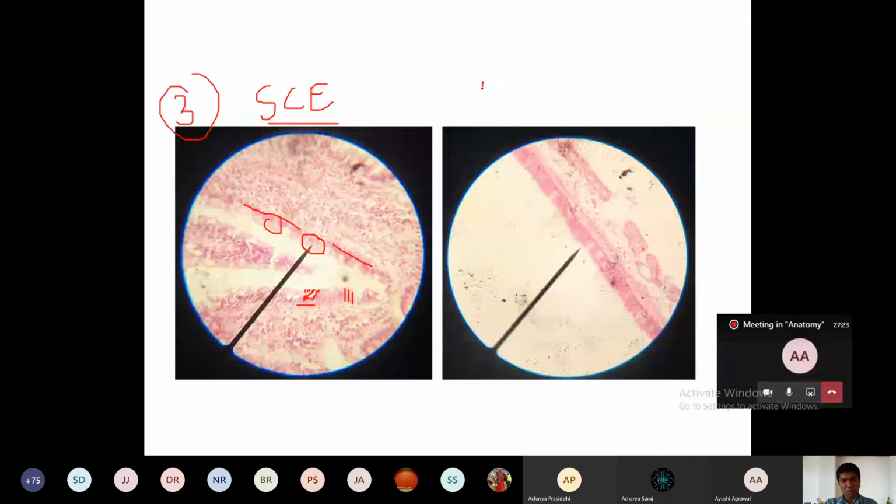Now I'll go to the number 4. I have to finish so many things. Already 27 minutes are done. So I'll go to the number 4. What is this one? Number 4, another person. Just a minute, I'll pick up the person.